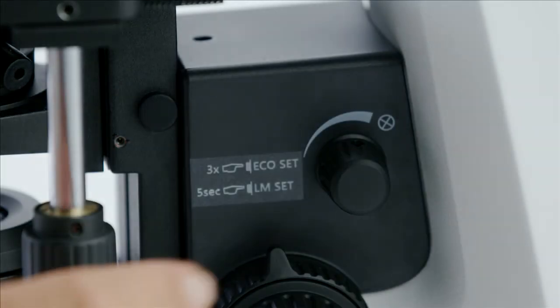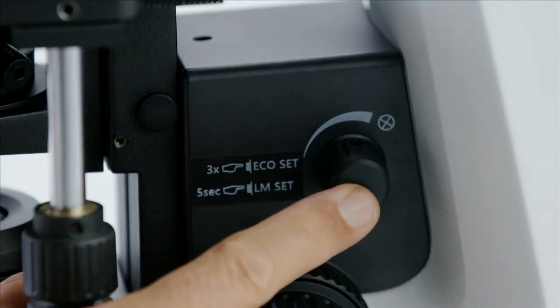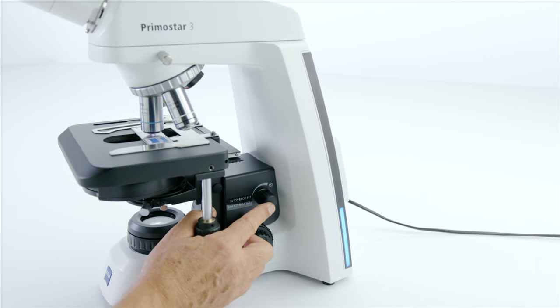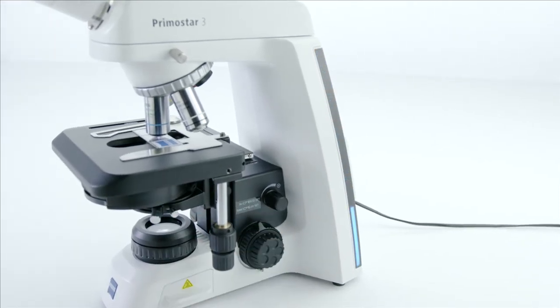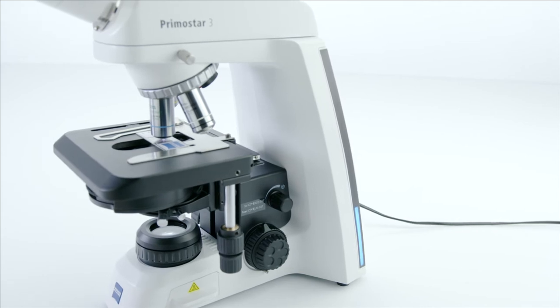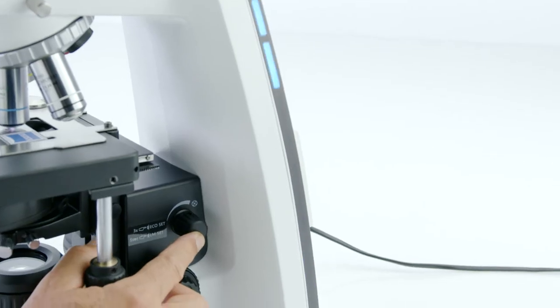Push the Light Intensity knob for 5 seconds to activate the Light Manager. The LED belt on both sides of the microscope stand will indicate this status by reducing its intensity from maximum to minimum.